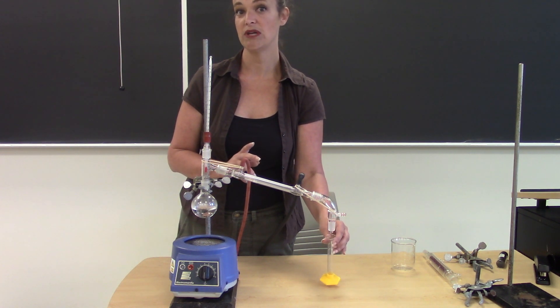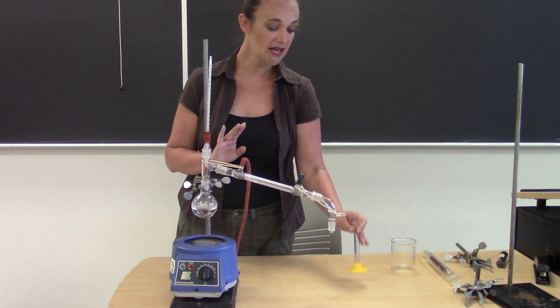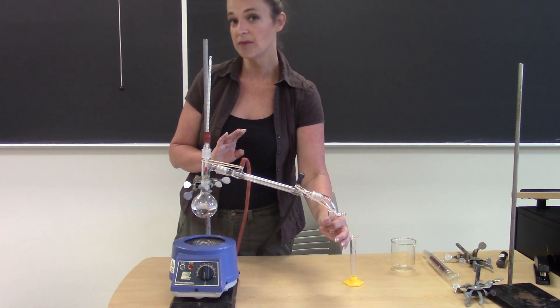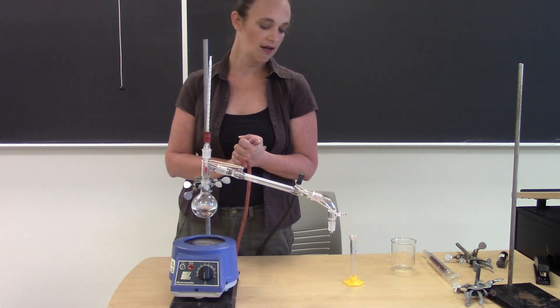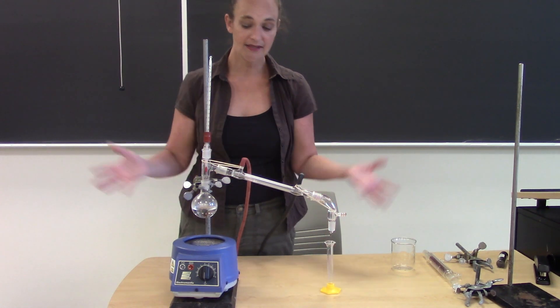Now in lab today, we are just going to be collecting it in a 10 milliliter graduated cylinder. Sometimes you would connect another round bottom flask over here. It's really kind of your choice.